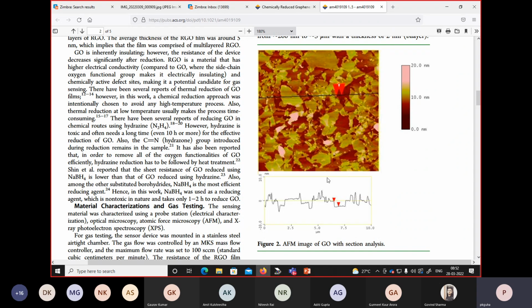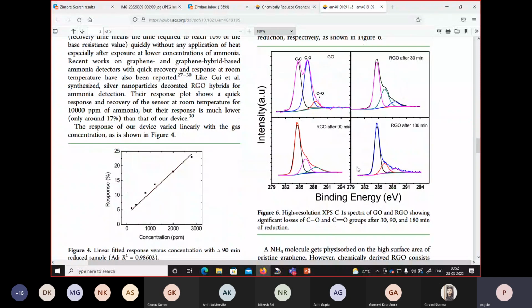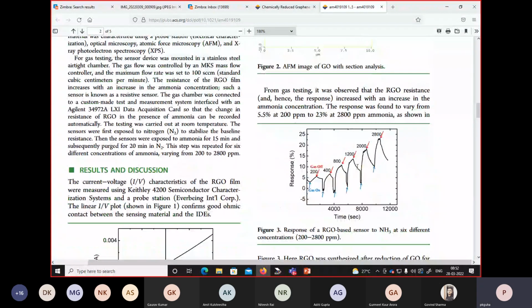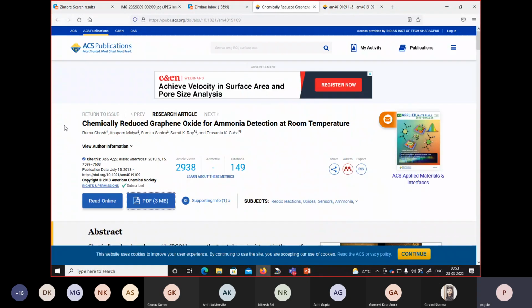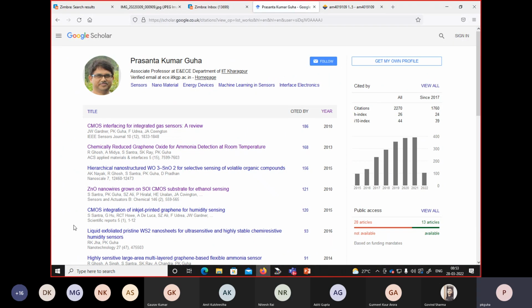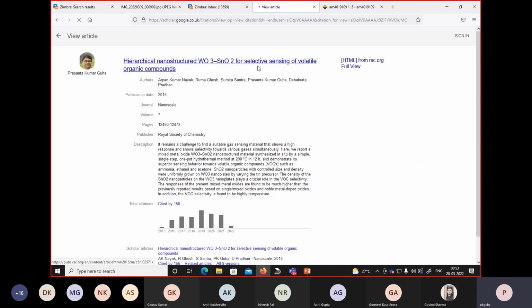So this is the kind of AFM image, but I have shown you SEM images. SEM image is completely different. It's like actually you are seeing the object with your eye. So SEM image looks a bit different. Let me see if I find one SEM image, maybe here.